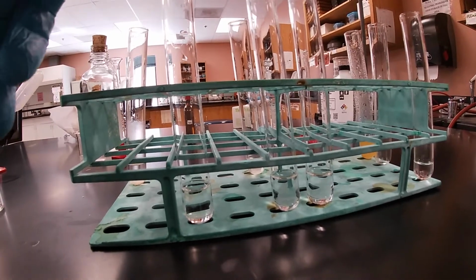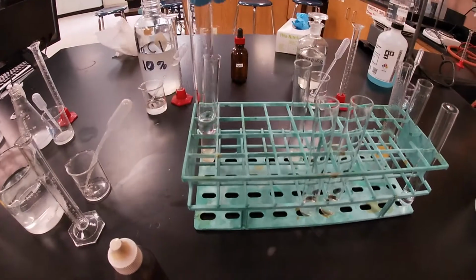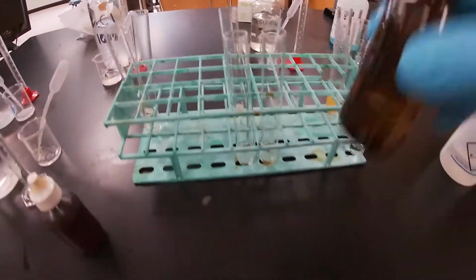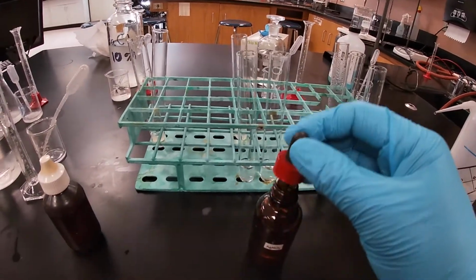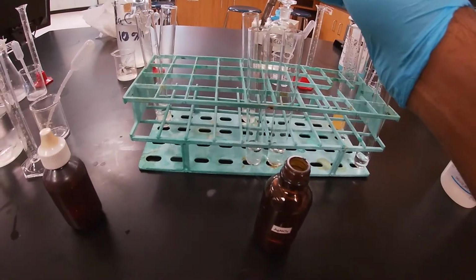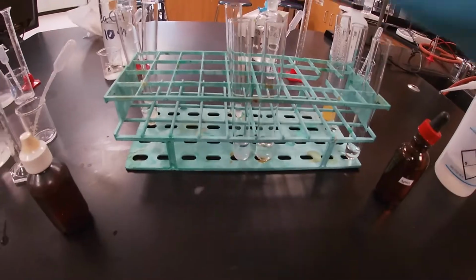Let's go ahead and add our silver nitrate drop. So that's for this one. So that's at 0, initially. And so let's go ahead and add our silver nitrate. I'm gonna add a couple of drops. And see if there are any.